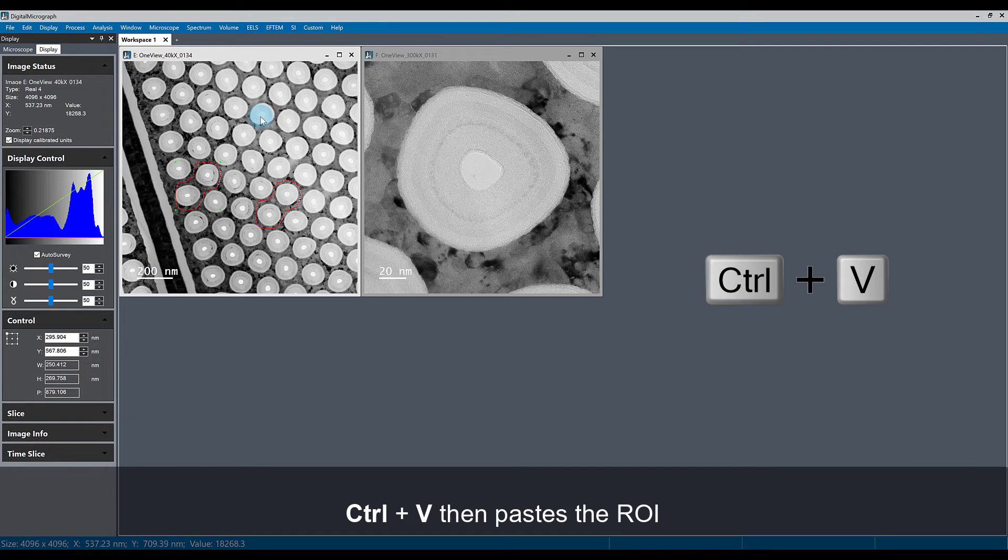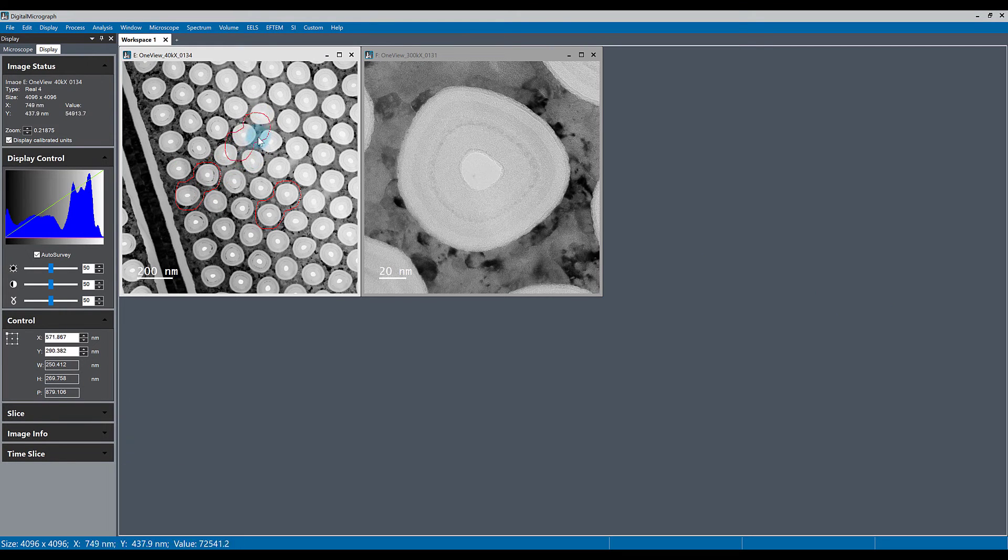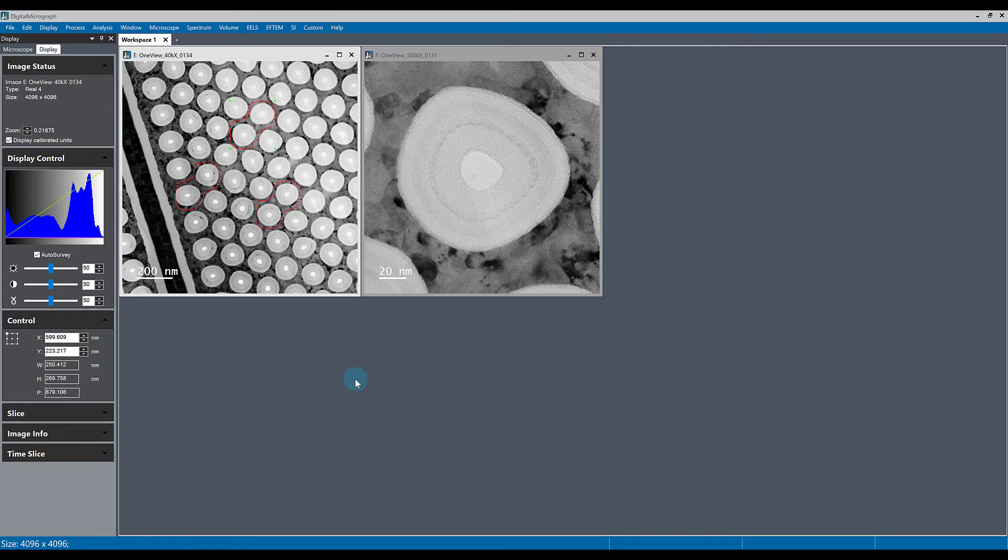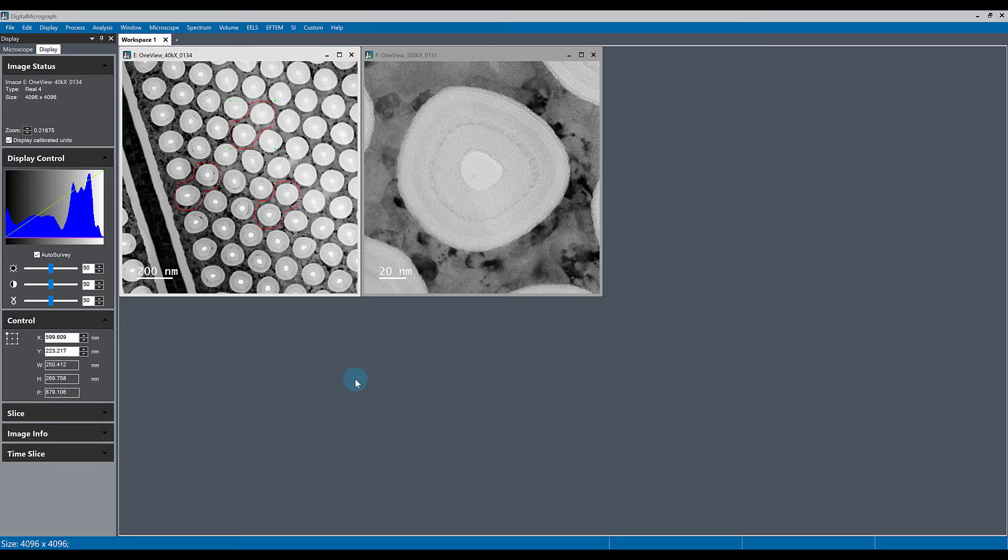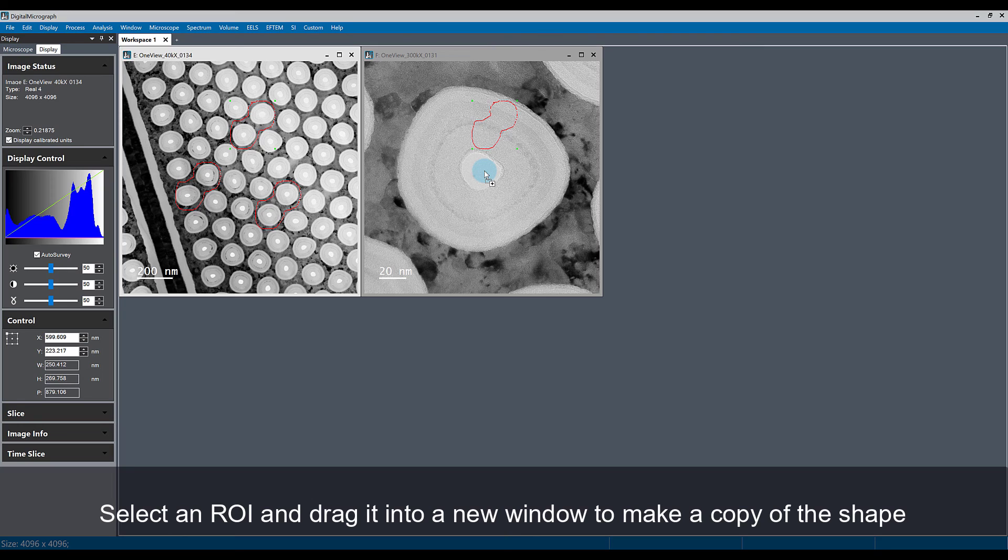Now I have three ROIs here. One very easy thing you can do of moving an ROI from one window to another window is simply clicking the ROI and dragging it into a different window.